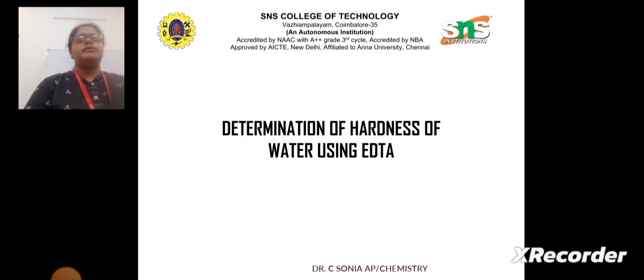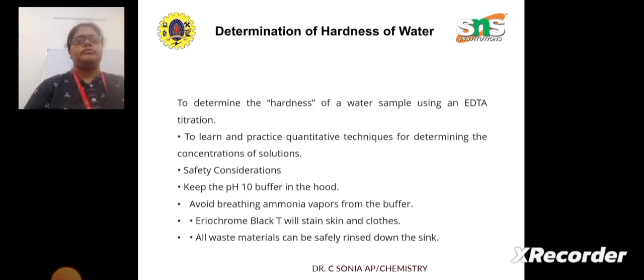In this video, we are going to see how to determine the hardness of water using the EDTA method. In this, we are going to learn and practice the quantitative techniques for determining the concentration of solutions.